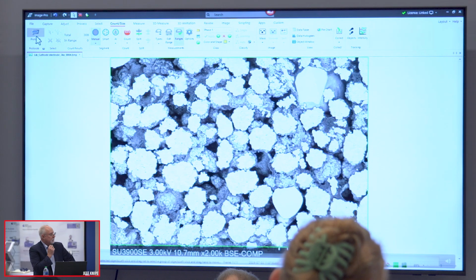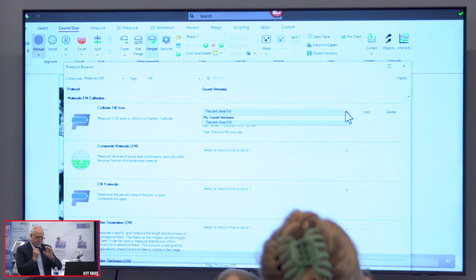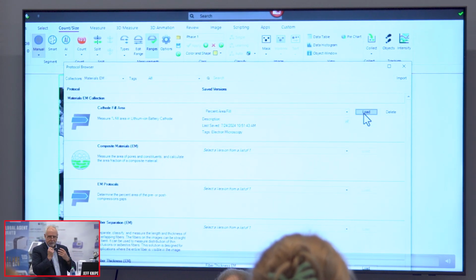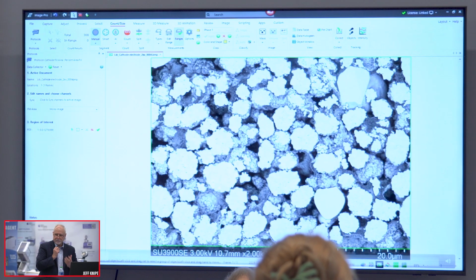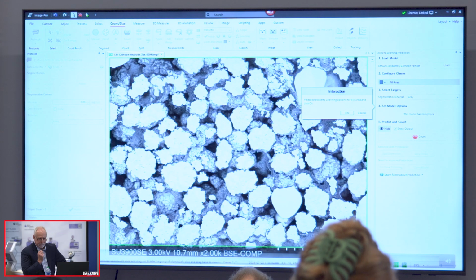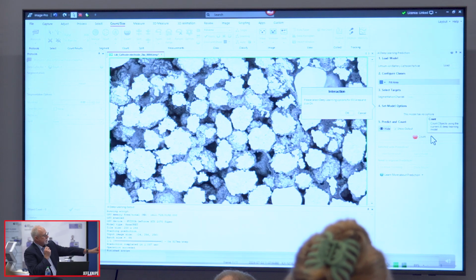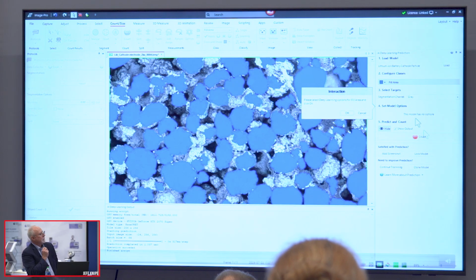This is just a quick one creating, but in essence, I trained the model, found the areas that I want, and in the training, made sure I only identified the areas that I want to measure or the type of sample I want to measure. Besides anything that's really sitting on that surface, and avoid anything that's just below. And then calculate the fill area versus non-filled area. And that was an example of the ROI around there, so I exclude it.